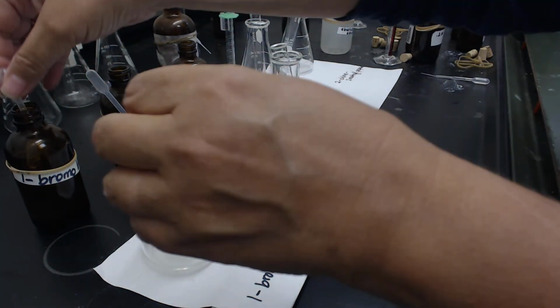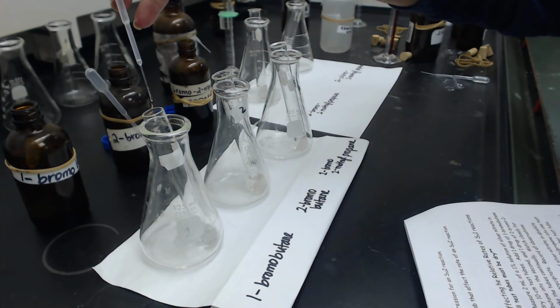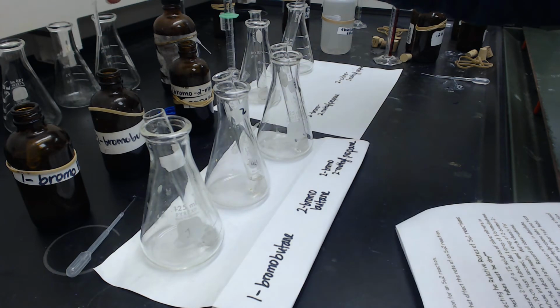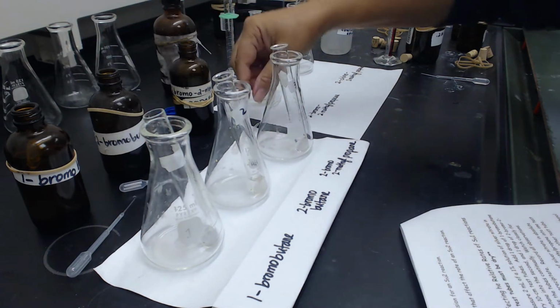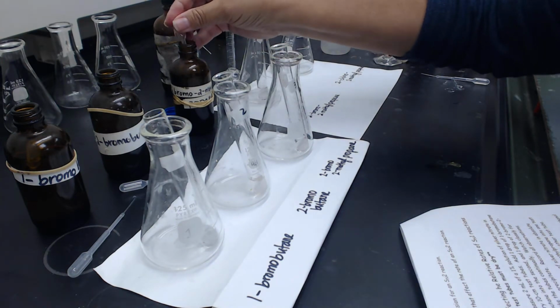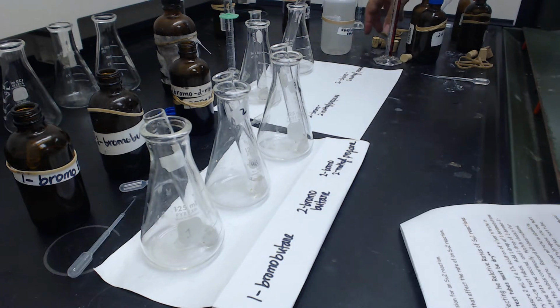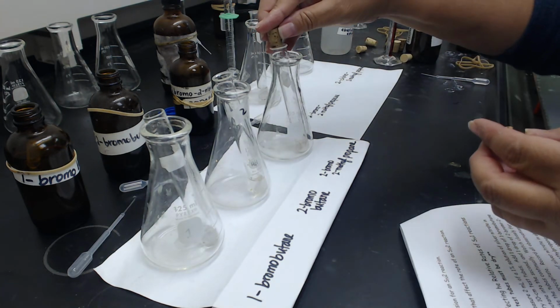So let me do that. Stopper them and stir them.